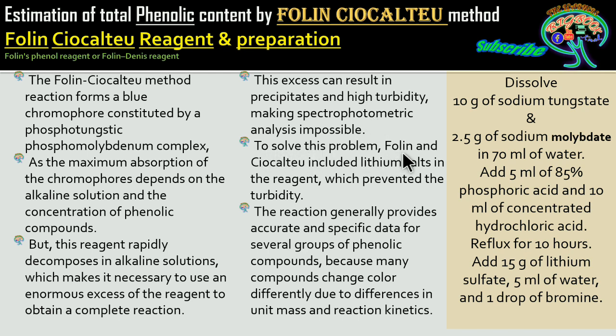To solve the problem, Folin and Ciocalteu included lithium salts in the reagent, which prevented the turbidity. So because of the lithium salts, the formation of more precipitate has been reduced and a clear solution is seen. The reaction generally provides accurate and specific data for several groups of phenolic compounds, because many compounds change color differently due to differences in the unit mass and reaction kinetics.